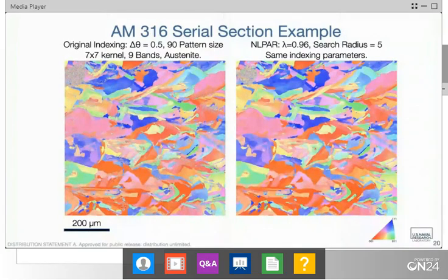Very good. Peter Kronenberg has a question of how am I remapping the orientation data, and how am I dealing with interpolations and those types of things. Very good question, Peter. So there's two things. The first part of the answer is the disappointing one. I'm using nearest neighbor resampling. So that's how I avoid having to figure out how to interpolate. I don't. I just grab the nearest index point.